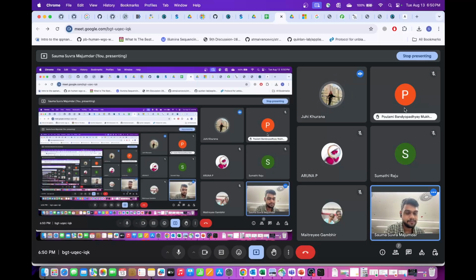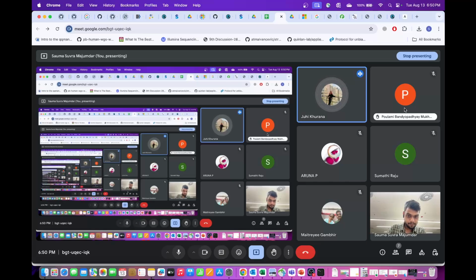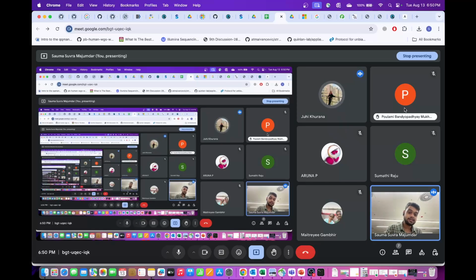I was asking GPT about the VCF specifically. There are issues because, as I said, for variant calling in humans we do it differently because we are diploid and there are certain things we check. For haploid organisms, variant calling is slightly different. We call variants on both strands of the chromosome, coming from the mother and the father, when you're doing germline variant calling. If you're doing somatic variant calling, it's kind of similar, but germline variant calling is quite different for other organisms compared to humans.